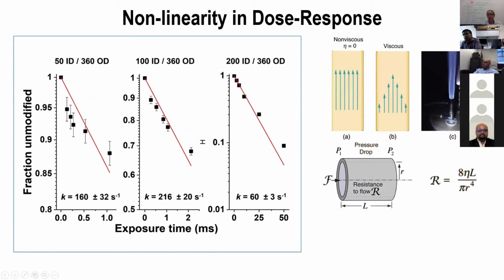This is like a Bunsen burner. When you light the burner, the flow is just laminar, kind of parallel, but sometimes it forms a cone. Because of surface drag, the resistance of the flow tends to slow it down, so you get more and more exposure. This is very bad for our purpose because we need a linear dose, since we need to compare different dose rates.